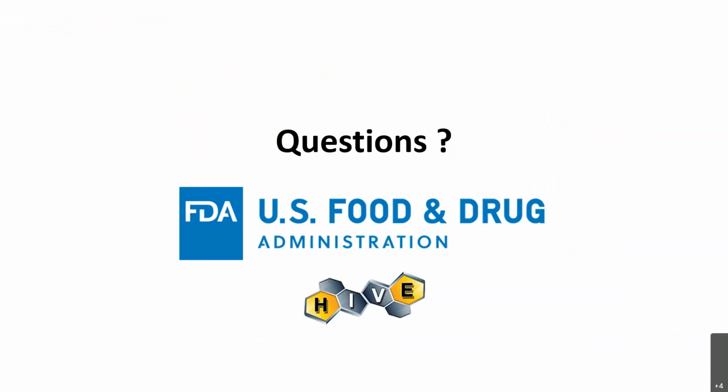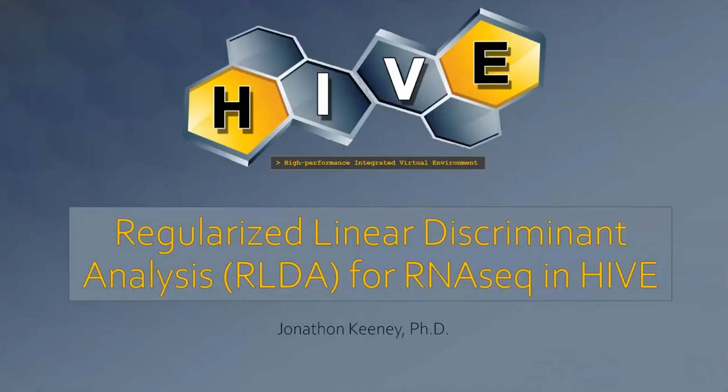Let me say thank you very much to Luis for demonstrating how to do RNA-Seq in Hive using third-party tools that I think many people have probably heard of. I want to take just a few minutes here, though, and tell you about another way to do RNA-Seq in Hive using tools that are native to Hive: linear discriminant analysis in Hive.